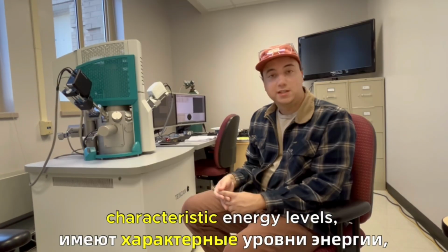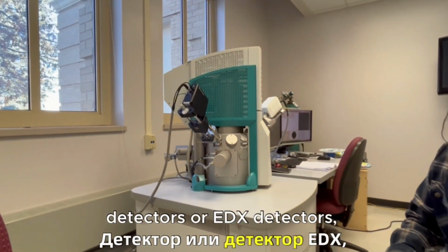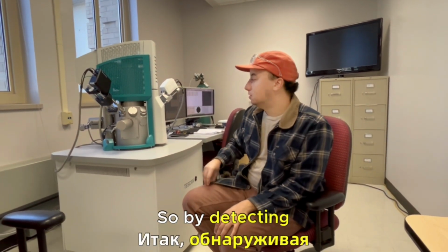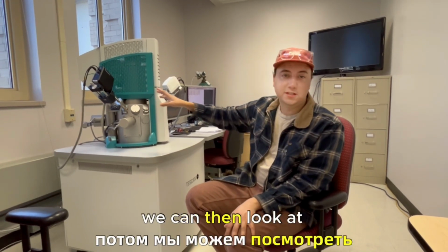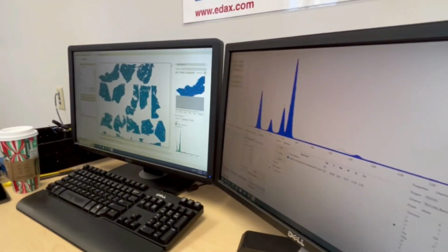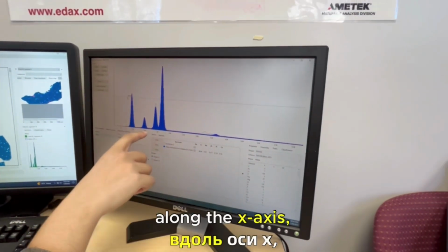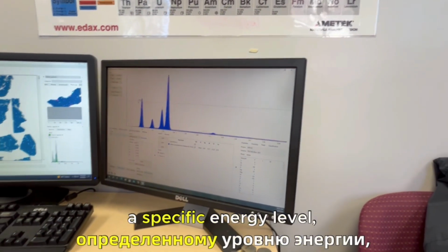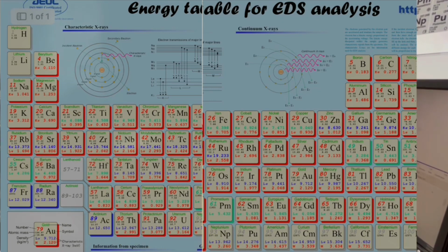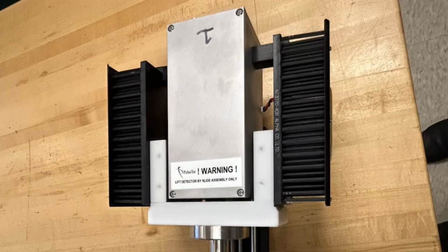Those X-rays have characteristic energy levels, and so we can detect those using these detectors. These are called EDS detectors or EDX detectors, which stands for Energy Dispersive X-ray Spectroscopy. So by detecting those characteristic energies, we can look at something like this over here, and we generate a spectra on the right here. At each of these points along the x-axis, this corresponds with a specific energy level, and that energy corresponds to certain elements. Through that, we can look at the proportions of elements and determine what the mineral is.